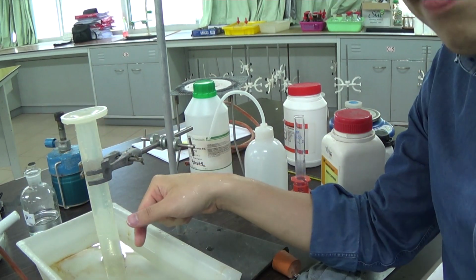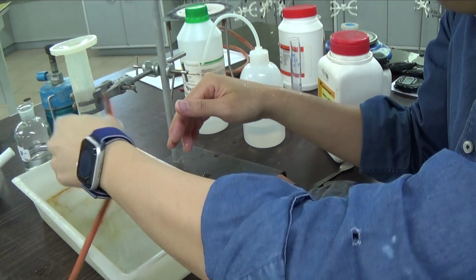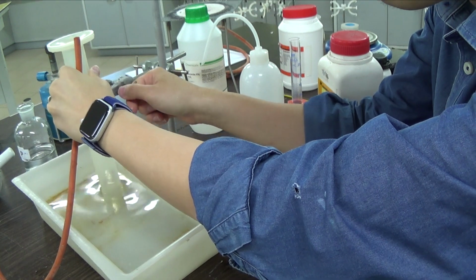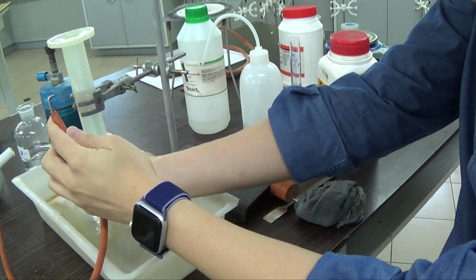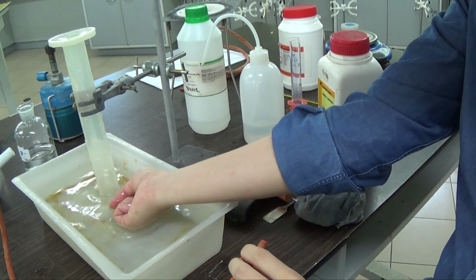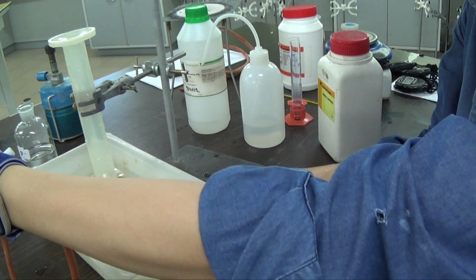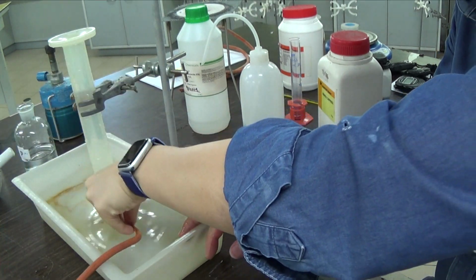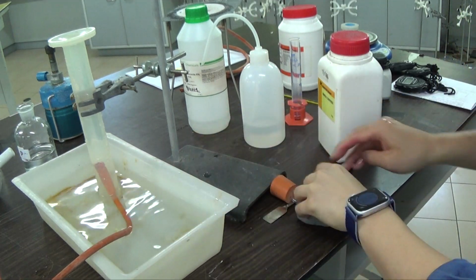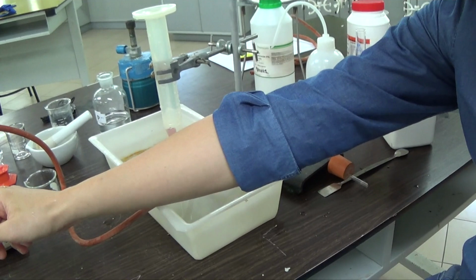I was just saying, you do not want to lower it all the way, because you need to have an inlet for you to poke this into. So I'm going to lift this up a little bit so that I can see there's a space at the bottom here. Okay, I can put my finger underneath here. For this delivery tube, for the gas collection, I have to put the hose in here, for the gas that is being produced from the conical flask.